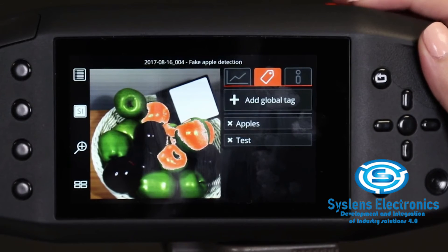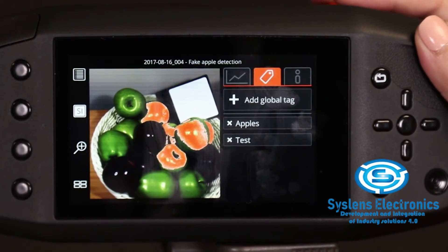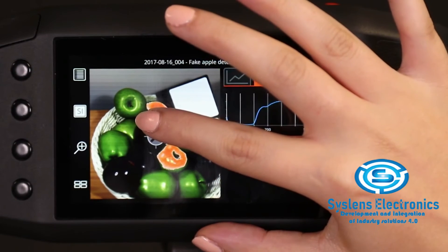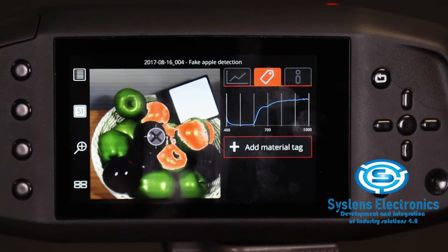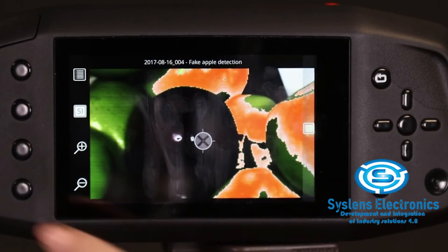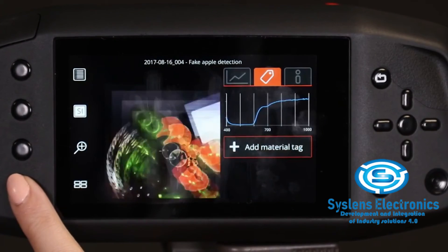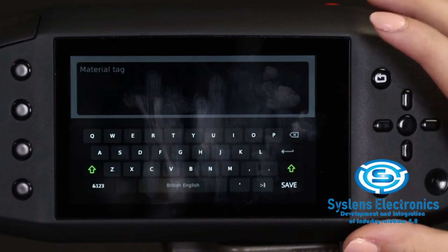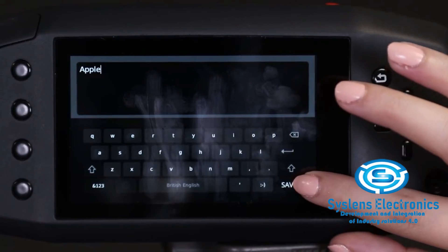The saved global tag appears on the tags list. To add a material tag, touch a pixel in the image on the touch screen. Study the spectrum, and if necessary, zoom in with custom 3 to verify the source. Once you have the correct pixel selected, select add material tag from the touch screen. Type the name for the tag and press save.